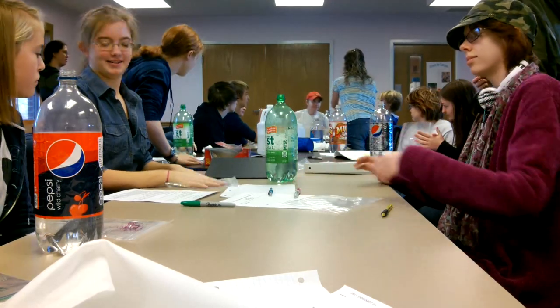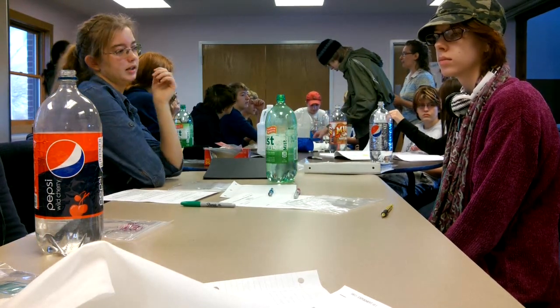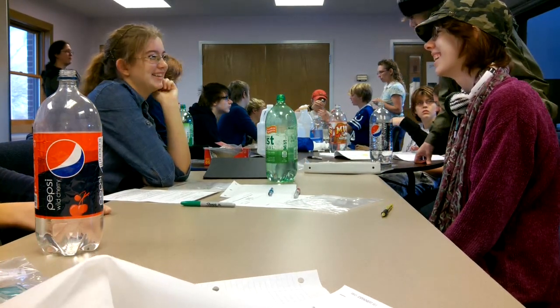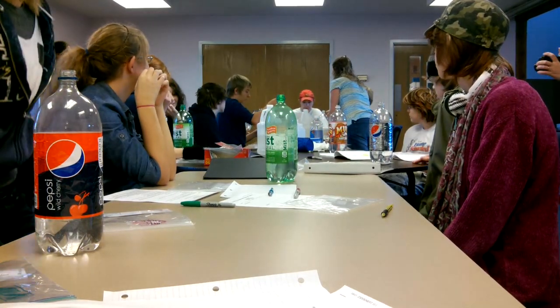One teaspoon — there we go. It will bubble, don't be scared, it will bubble. As soon as it's done fizzing, you're going to add another third. Yeah, we don't do that yet.